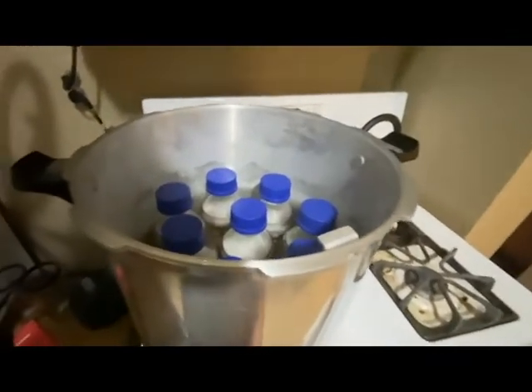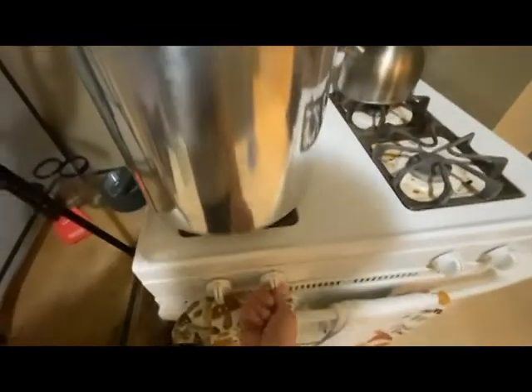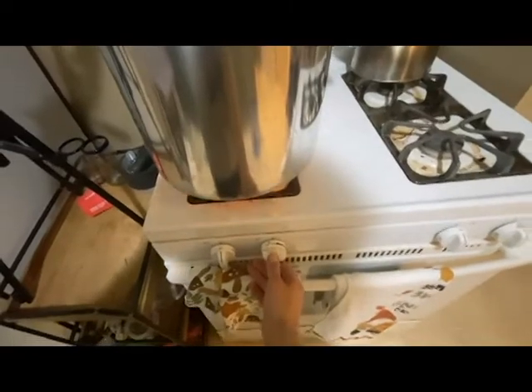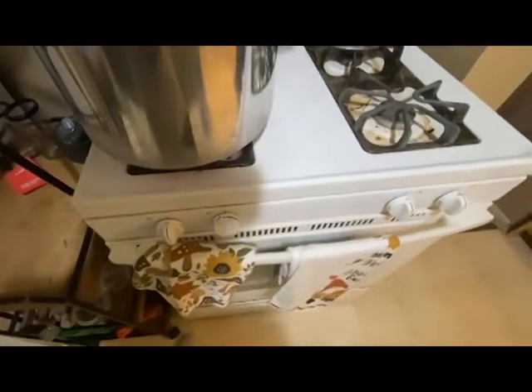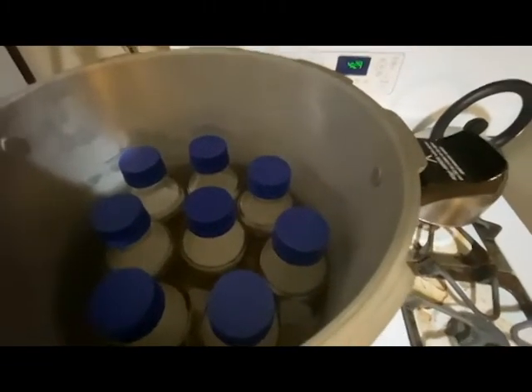So we will get this started by turning the oven on, or the stove, full blast. Wait for it to heat up a little bit, throw the lid on, and pressure cook for about 20 minutes.